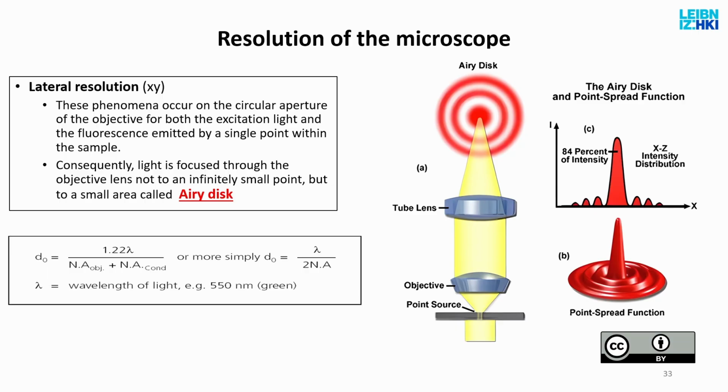And here I have, let's say, a fungus, some micrometers. And my objective resolution is 2 micrometers. It's a cheap lens. Then what I see on the other side as an image is not the image of the small object. Instead, what I will see here is a pattern like this.